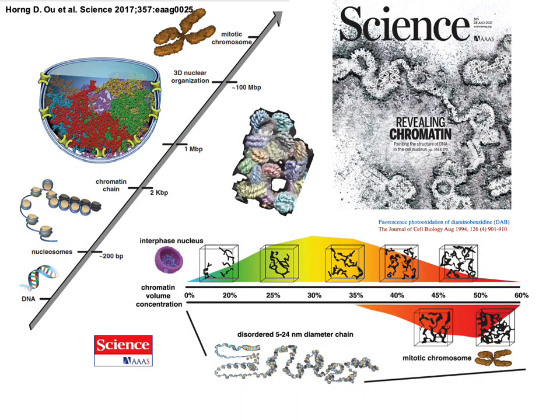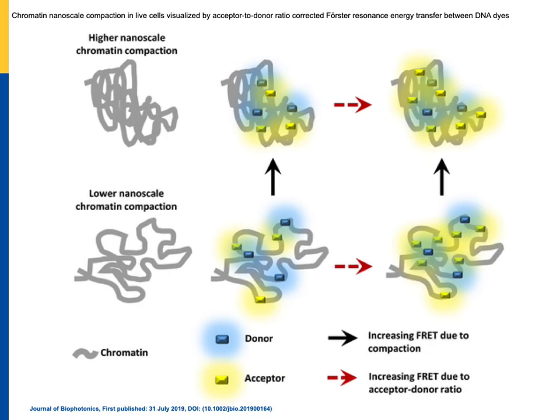There was a very interesting paper in the summer of 2017, so 5 years ago, reporting about a new model of chromatin, a new model of organizing this arrangement made by proteins and DNA. The way it is compacted is the key for understanding something. Well, of course, we can use fluorescence. Maybe you heard about FRET. I don't mind going into details about FRET, but with FRET, fluorescence resonance energy transfer, what you can do is the following.